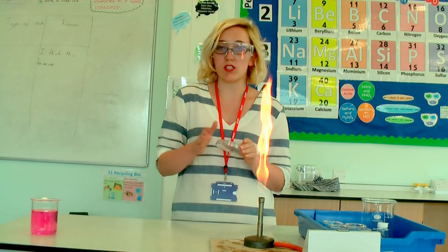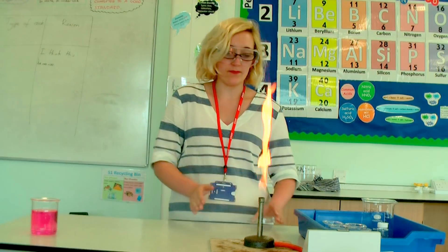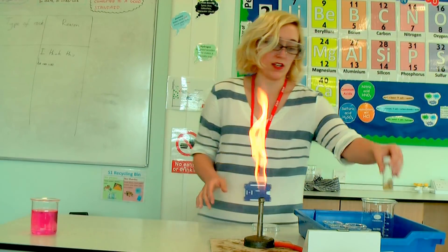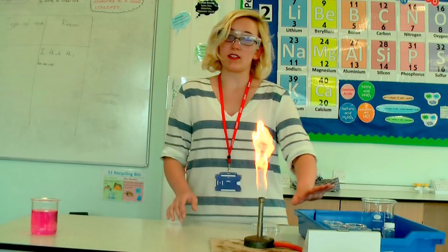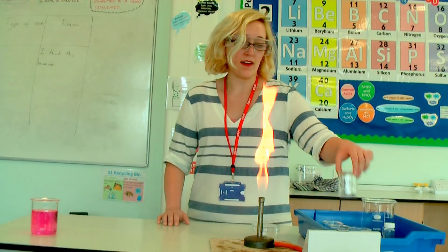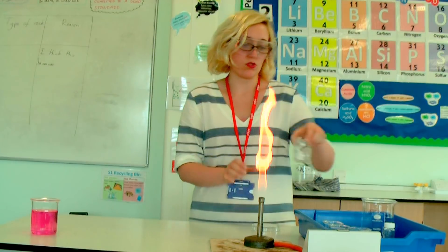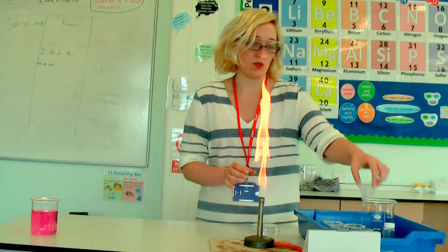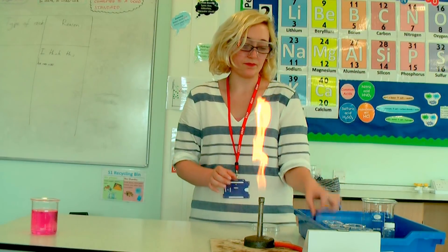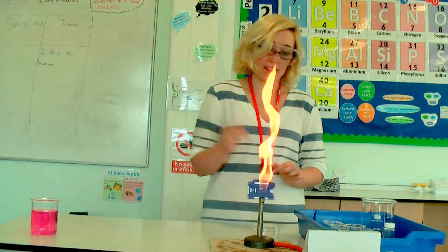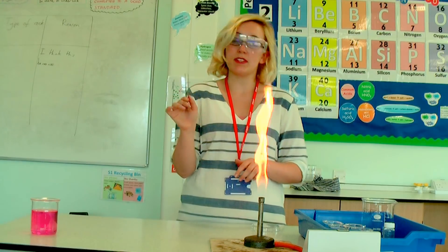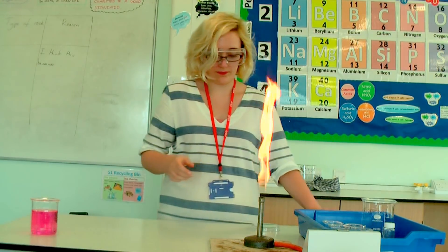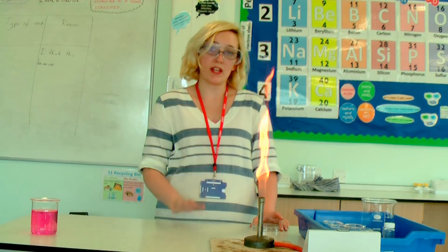What you will need before you start this practical is a petri dish with agar jelly. You will need a preparation of the bacterium — I'm using E. coli today. You will need three disinfectants and one distilled water to use as a control. You will need some small paper discs, usually cut out of filter paper, some sterile pipettes, and a spreader — I'm using a plastic spreader. You can also grab a pair of tweezers.